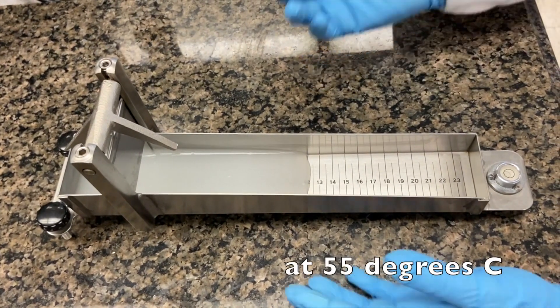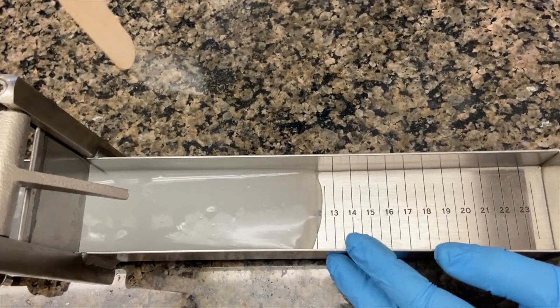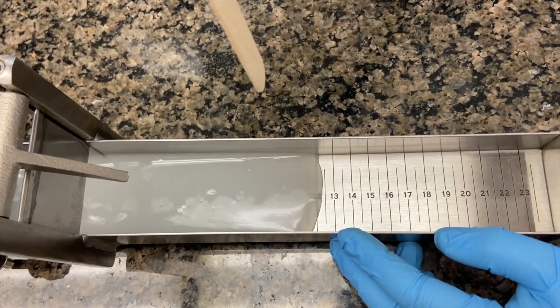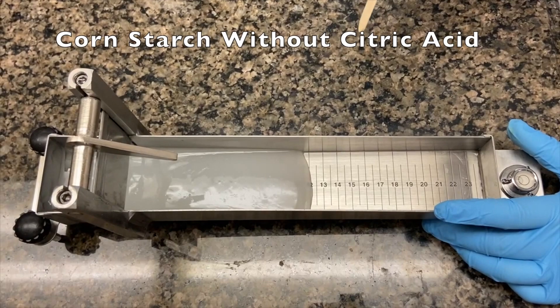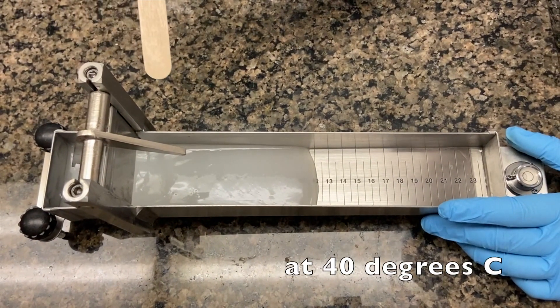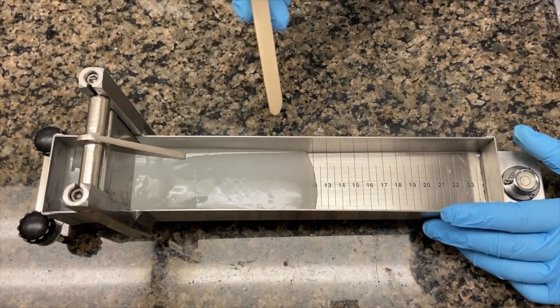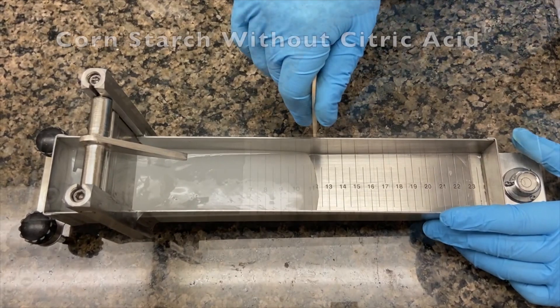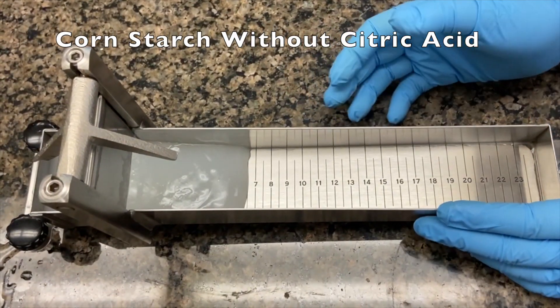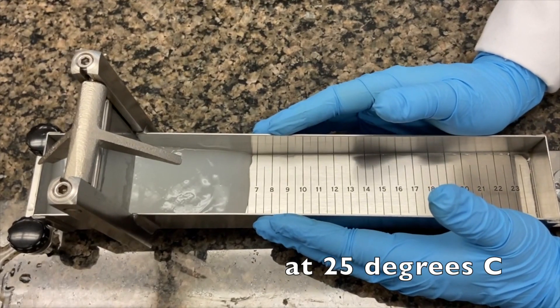This is the recording of cornstarch without acid at 55°C after one minute. Then cornstarch without acid at 40°C — reading after a minute. And this is the reading for cornstarch without acid at 25°C.